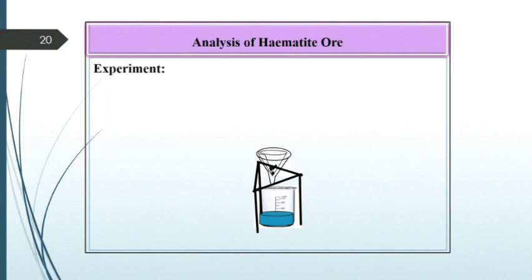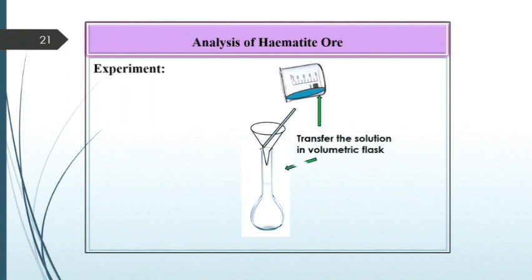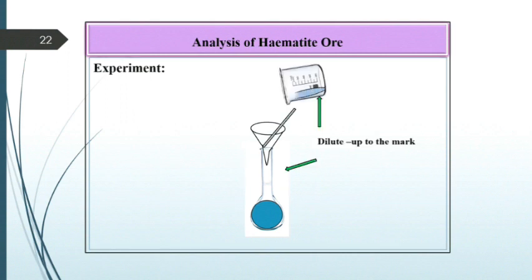Now collect the filtrate and washings in the same beaker. Then transfer this solution in a 100 ml volumetric flask and dilute it up to the mark by using distilled water.